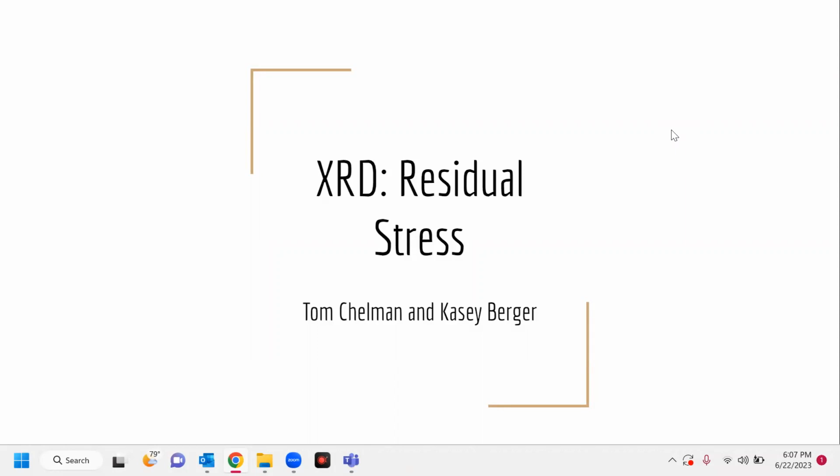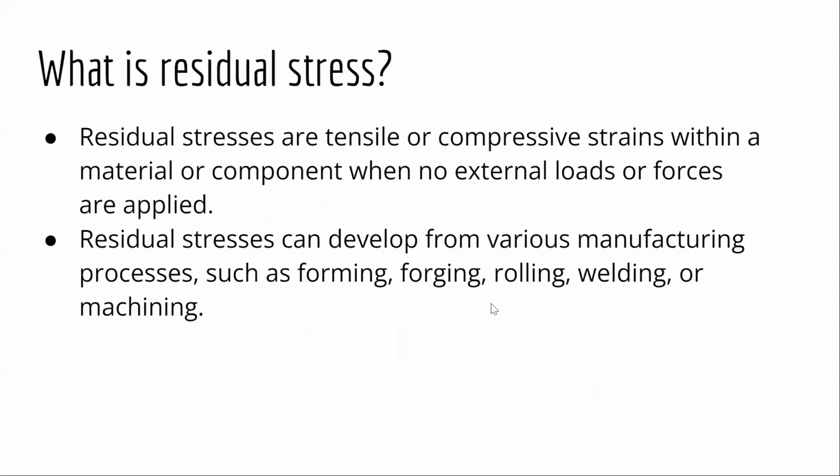And today we'll be presenting on X-ray diffraction and residual stress. So what are residual stresses? Residual stresses are tensile or compressive strains within a material or component when no external loads or forces are applied. Residual stresses can develop from various manufacturing processes such as forming, forging, rolling, welding, or machining.